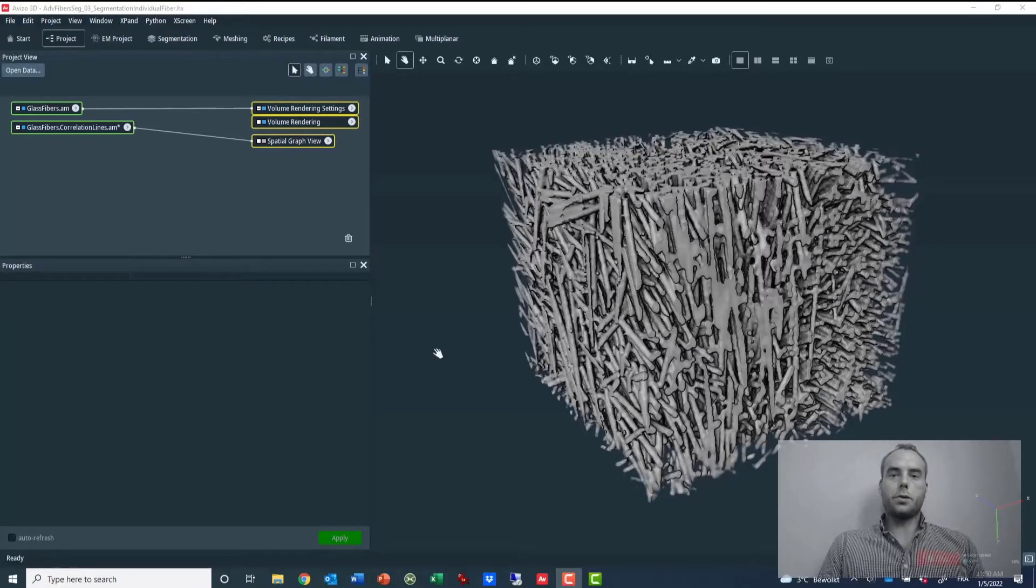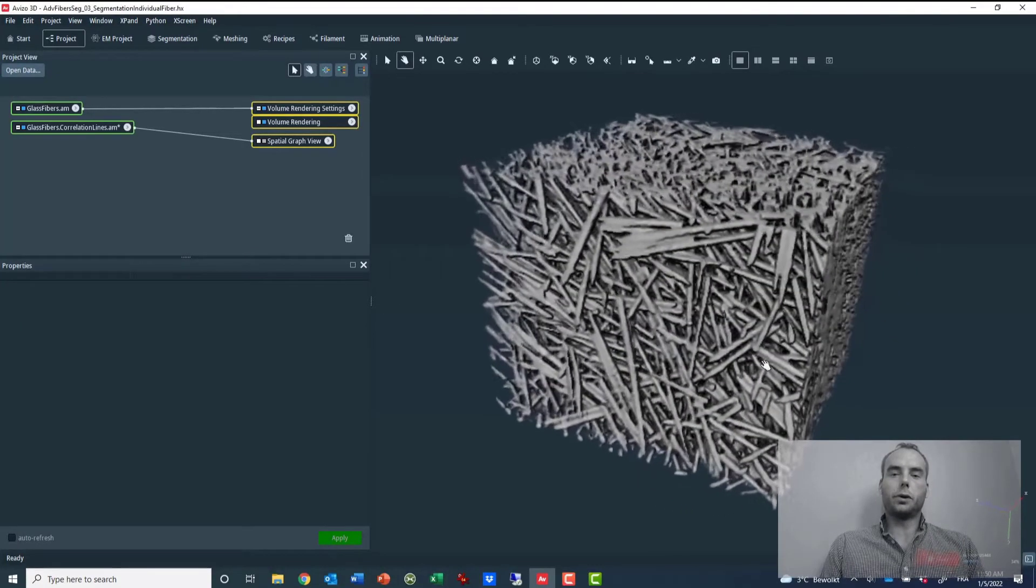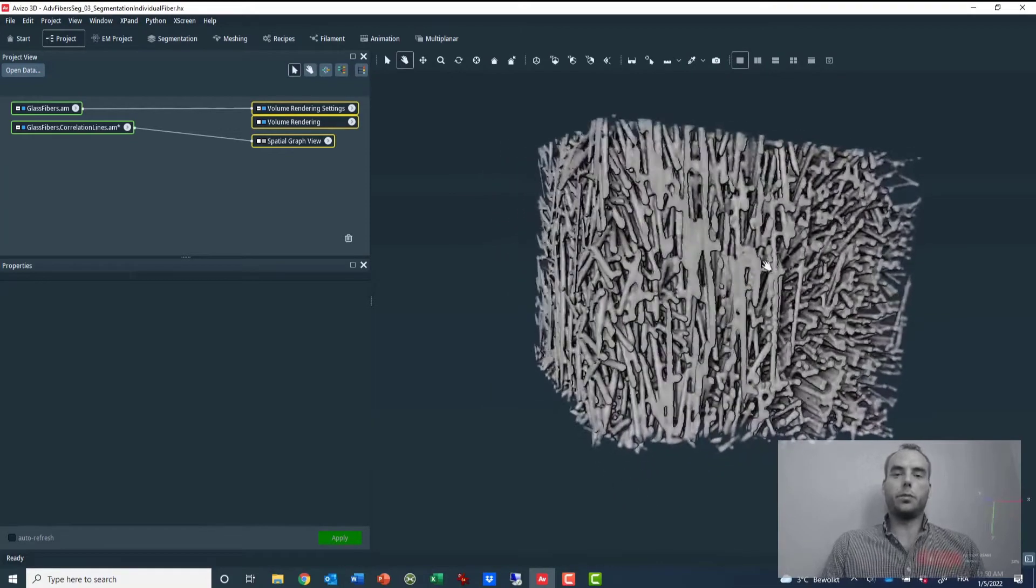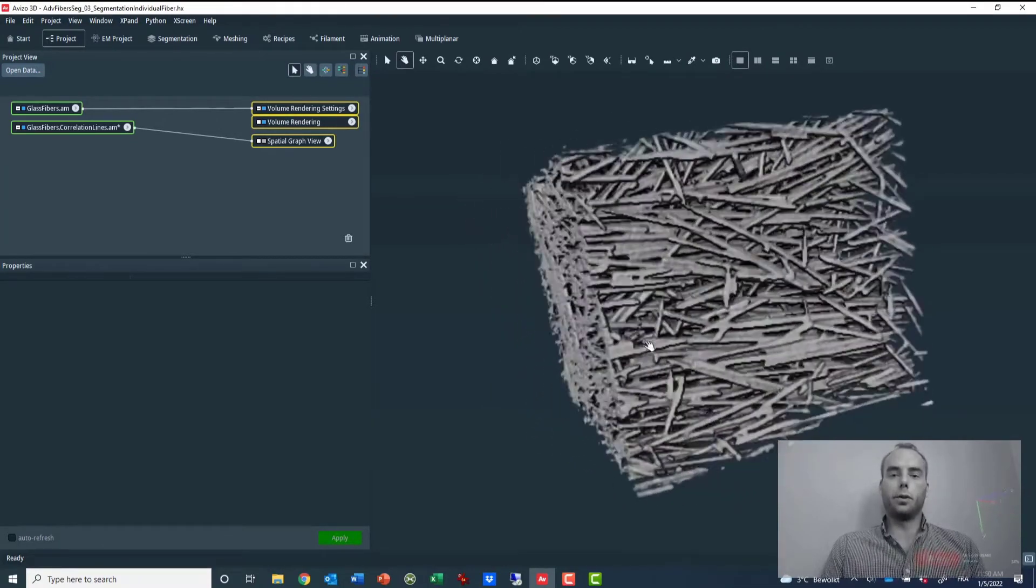Hello, so today I'm going to show you how to display a small portion of a volume and to use that small portion to inspect the whole volume.